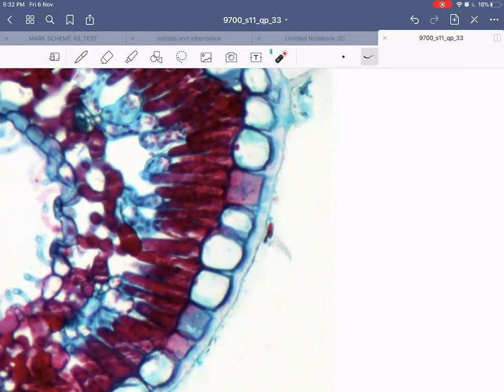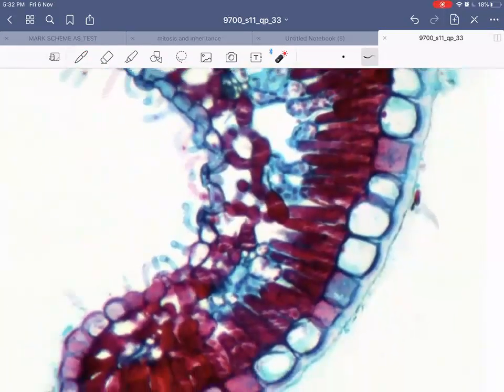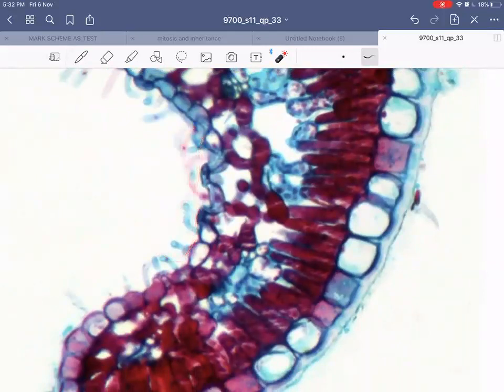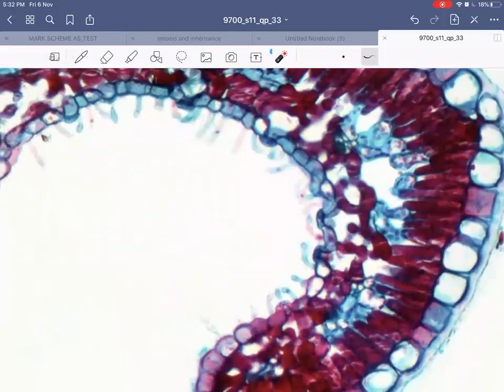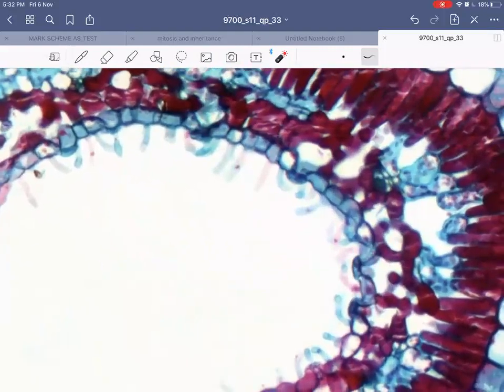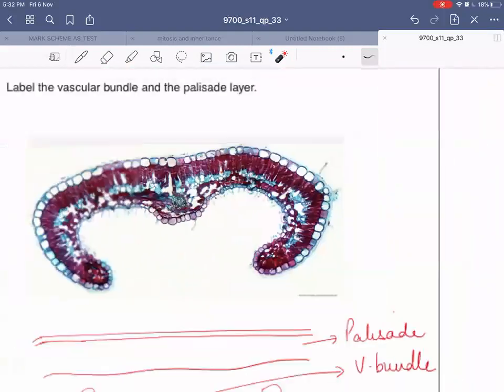Trichomes are hairs and you can see lots of trichomes - they are attached to the epidermal cells. For this, you will have to focus the slide on the high power, which is a power of 40, and then only you'll be able to see lots of these trichomes. So let's draw a high power drawing.